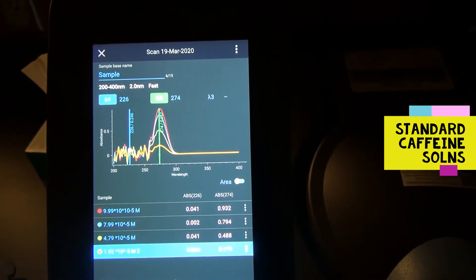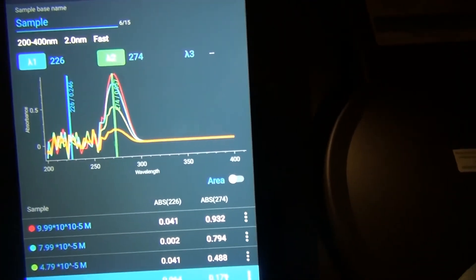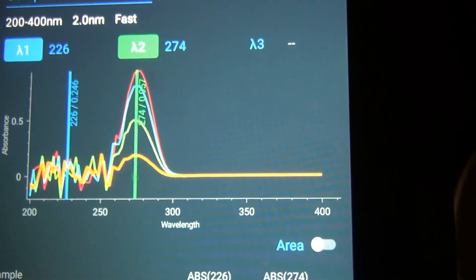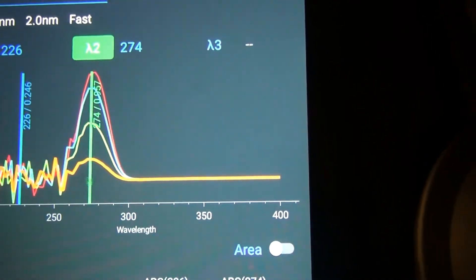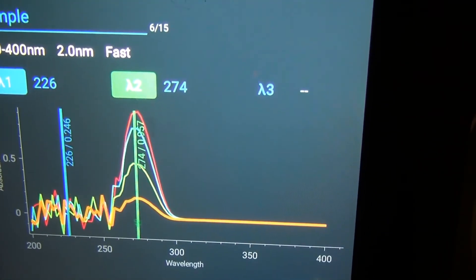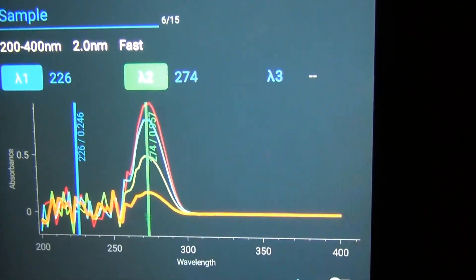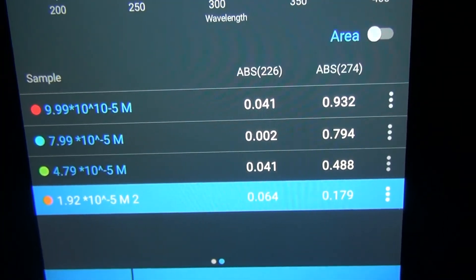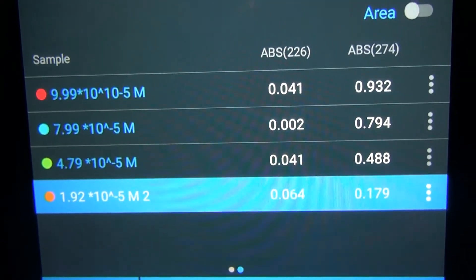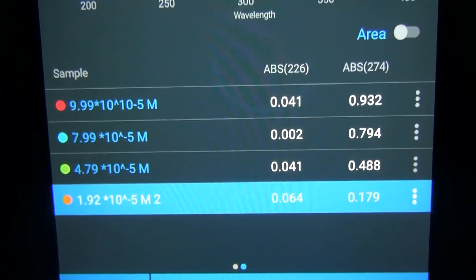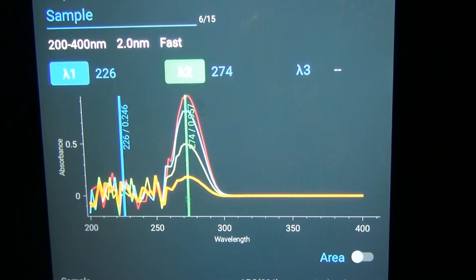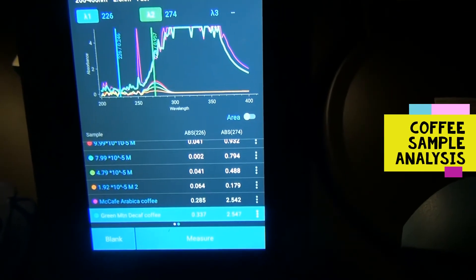I have run the standards — I turned the lights off in the lab because it was a little glary. This is the spectra for the standards: the red starting with standard one, then blue, green, and orange going down. The absorbance values are displayed below and I went ahead and labeled the solution concentrations for you. There's all of your data from the spectrophotometer — you have everything for in-lab that you need to record.